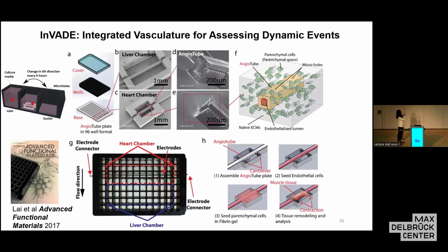So you have a little well within a well, and into this we put our polymer blood vessel with these microholes. And in some cases, we can also embed electrodes if we want to stimulate. We've so far only connected 2 tissues, which is probably enough. As you connect more and more, it becomes actually quite complicated.